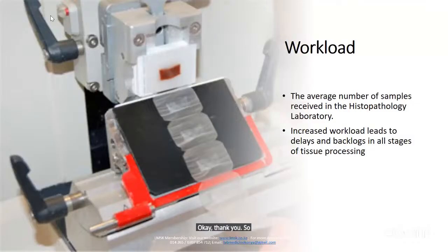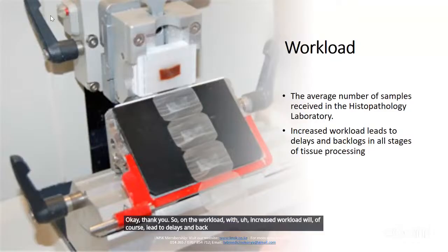So on the workload, this increased workload will of course lead to delays and backlogs in all stages of tissue processing.